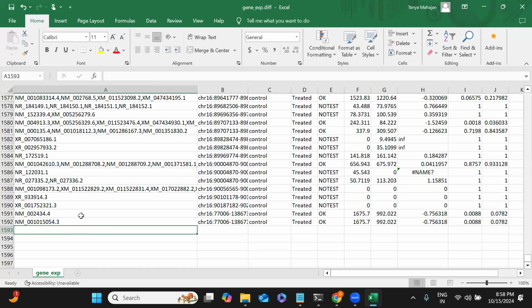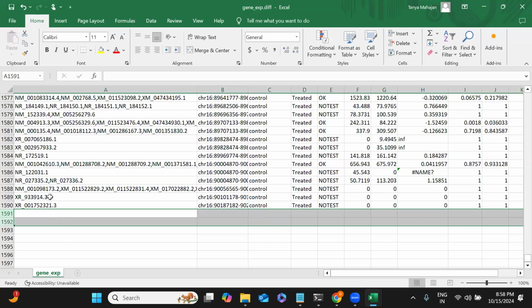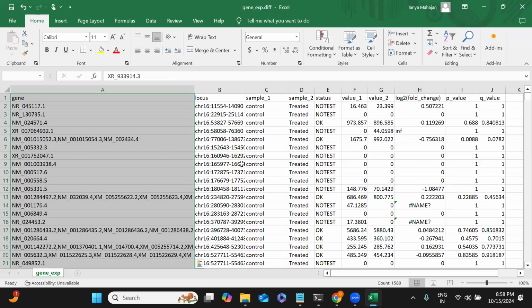Did you get what I did here? Yes, you split the three genes. Exactly. We have split that into different rows because they are coming from different genes, right? But if they are coming from the same gene, we keep it as it is. I will tell you how to deal with that also. But in real time, it will take a lot of time because we have to do this manually. So for now, I will just delete this. What about the others? Did you get this?